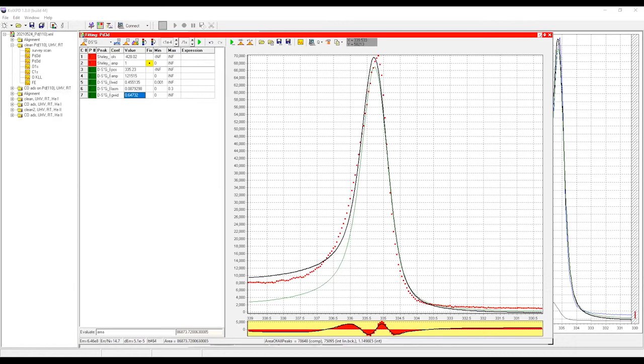So just another question. How do you do calibration of your work function? Do you measure the work function of gold, for example, to calibrate the energy? Here, we have gold and silver samples, two reference samples, and from time to time we measure the silver 3D spectrum.